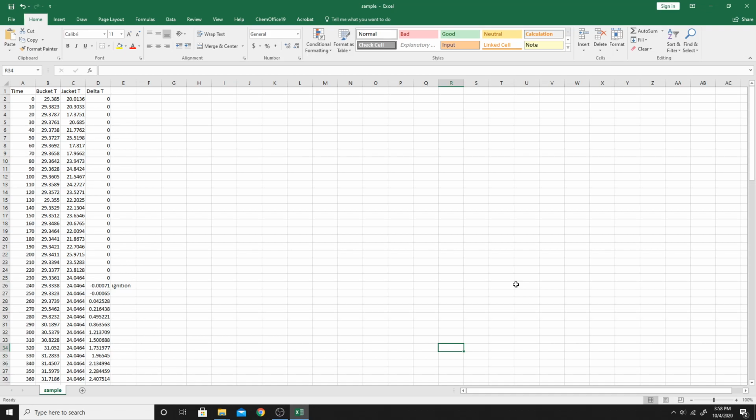Hello everyone, in this video I'm going to show you how to plot temperature as a function of time and find out the temperature rise, or delta T, due to the chemical reaction in the calorimeter experiment. So first you need to download the data files. In this experiment, the data file is saved in CSV format.